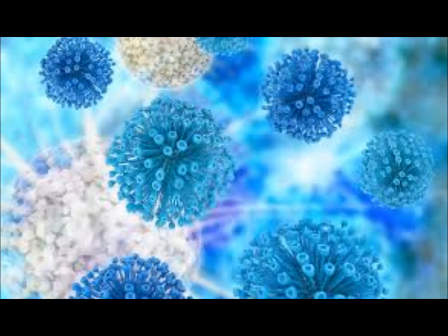And do you remember which organism I told you had a virulence factor that was on the PowerPoint slide yesterday as one of the virulence factors? We talked about pili and fimbriae, which help attach. There was one other thing we said a bacteria could have around it that makes it more virulent. Capsules. And guess which organism we're doing in class? Strep pneumoniae is a classic one to have a capsule. And sometimes look at your plates, especially, a lot of times it starts auto-lysing after 48 hours. That one can have like the little donut shape, that strep pneumo, when you look at your plates today.